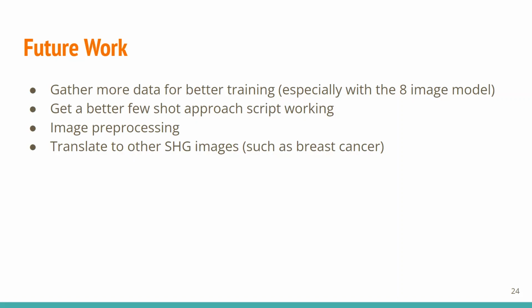We do have a breast cancer data set that we've acquired from biopsy slides, also from Maine Health. So to see if this model would be applicable to other cancer types as well would be a pretty cool and interesting thing to look into.